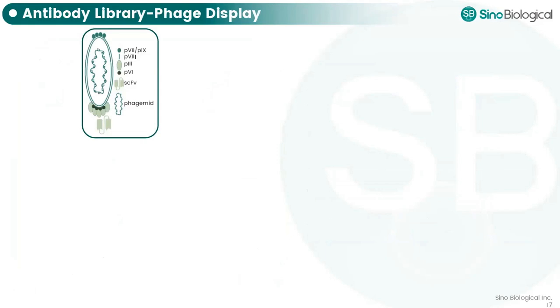So for the antibody library, the phage display: M13 is the most widely used bacteriophage of E. coli, and is also used for antibody phage display. The M13 contains five major coat proteins, which are listed here, and the most widely used for phage display is the protein P3. This one is fused to the scFv, the antibody fragment, for displaying the antibody sequences, because P3 has a relatively flexible structure and the ability to display large proteins without losing their functions.